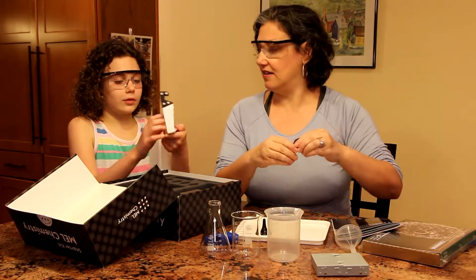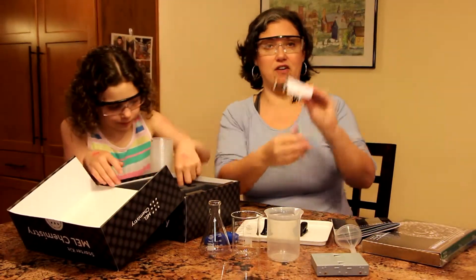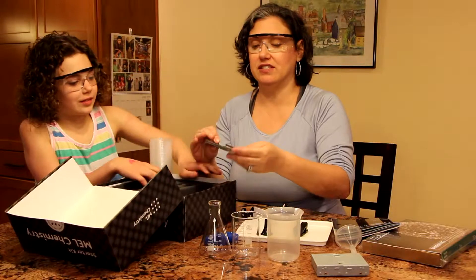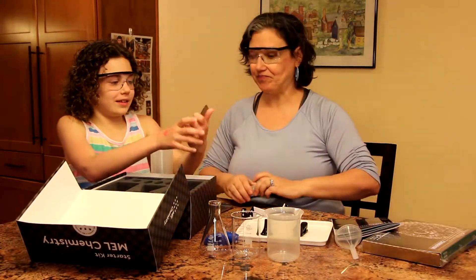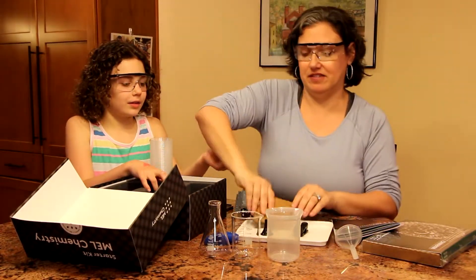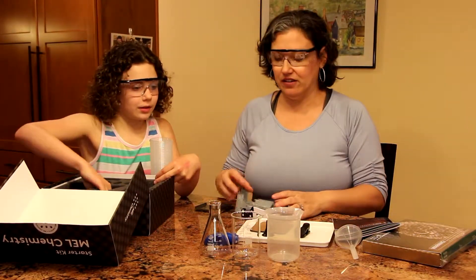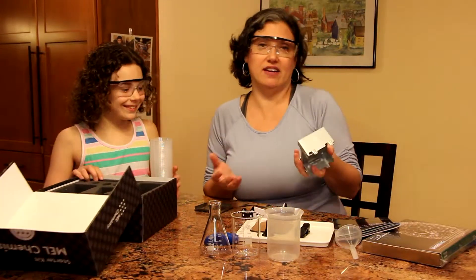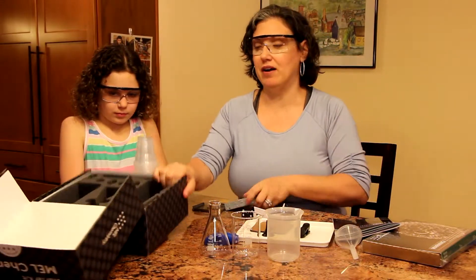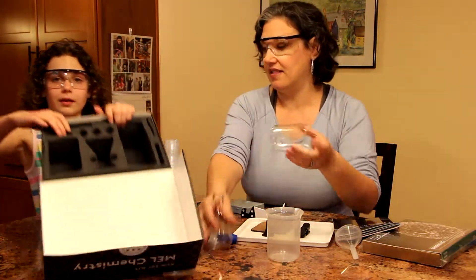That's neat. And there's also a stand. I'll bet they give you directions on the phone app or maybe on the iPad. So that would be a stand for that. There's some squishy stuff in there — this must go with the stove. And this is just a piece of hard particle board. So these are materials that you may use again and again with different labs. You want to keep these safe. I would suggest keeping them in the box because there is glass in here.